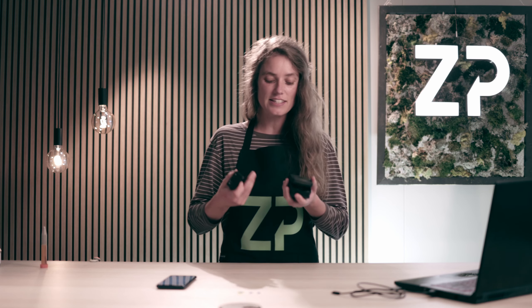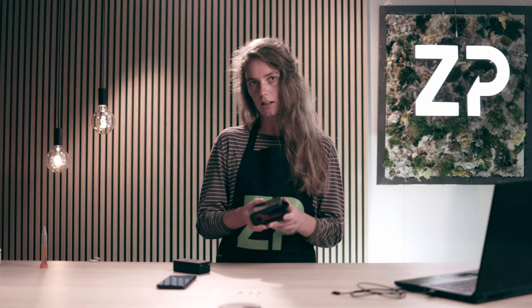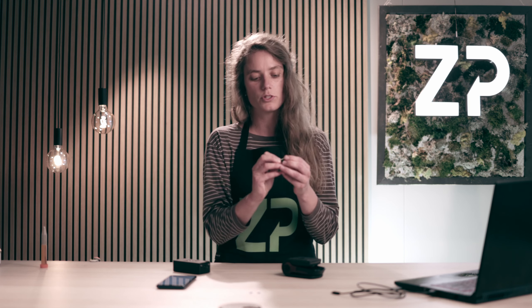As you can see, it still fits inside the palm of my hands, but we've made some improvements to the device and the technology itself. First and foremost, it's easier to use. We have reduced the risk of spill. We've also designed these cartridges that make the alignment more smooth, and it also reduces the risk of contaminating the electrodes when handling the sensors.